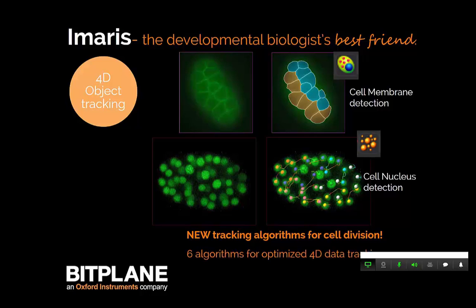Just to also point out, we have 6 different algorithms that have all been improved as far as speed, but these 6 different algorithms give the users the ability to choose the algorithm that best suits the structures of interest that they're tracking.